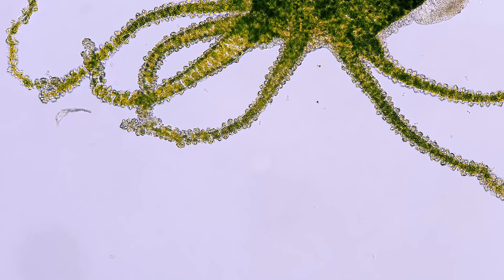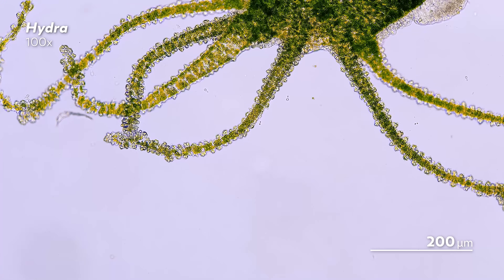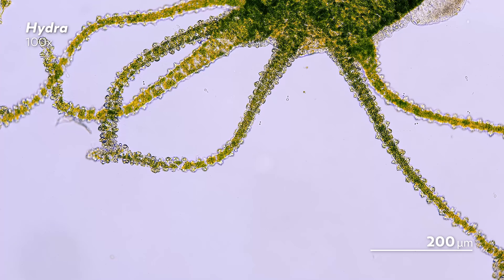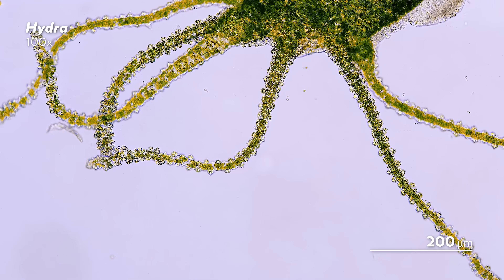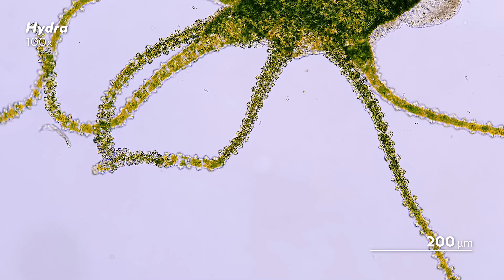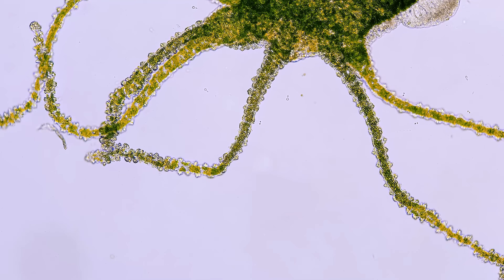Now I think one of the true joys of the microcosmos is getting to share what you find with other people. In fact, while watching our Hydra here, James got so excited about something that he saw that we're going to be making a whole episode about it soon. And fortunately, unlike the masters of microscopes of past centuries, we have many tools that make it possible to record our journeys and share them with others.